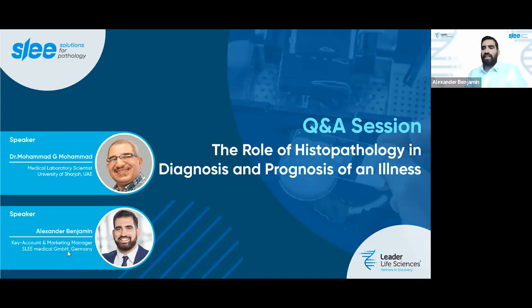Well, I would say that there are already some solutions for automatic staining. This is something that we provide. Today you pretty much don't have to do anything. You just enter the slides in the automatic stainer and then you get them out stained. Maybe the question had to do with the whole process being automated, or maybe some combinations. I'm not sure, but staining today is actually automated.